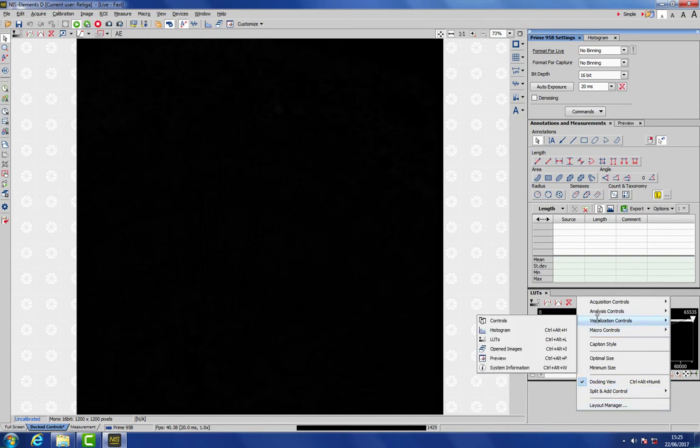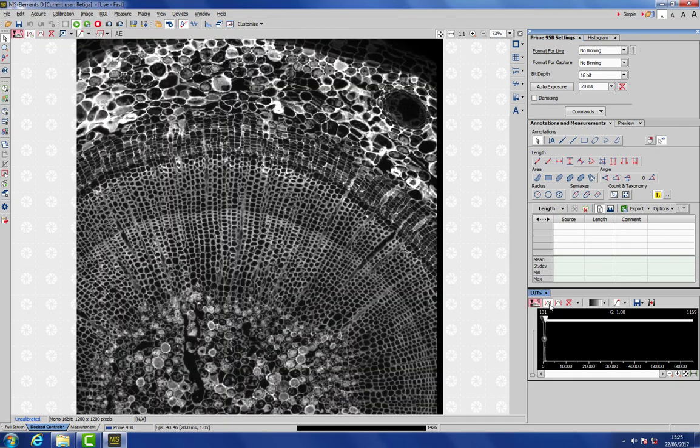So what we need to do is activate Lookup Tables, LUTs. And we do this by right-clicking on some grey area at the right-hand side, and choosing Visualization Controls, LUTs. And that will bring up this menu. So here we enable the LUTs, and then turn on Auto Scaling, and here is our image.